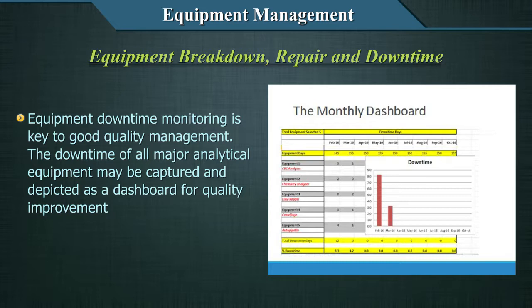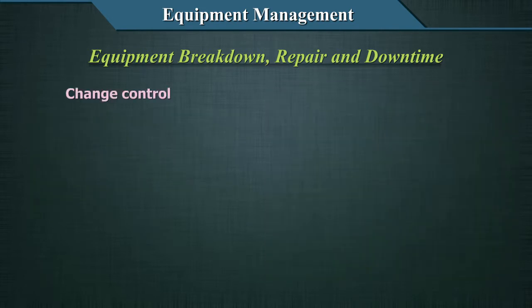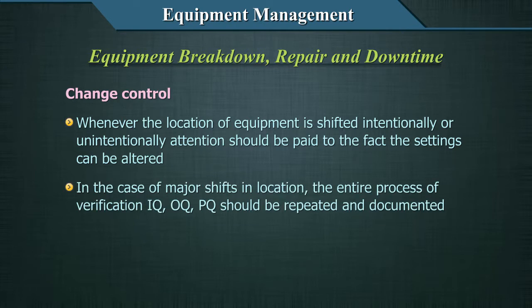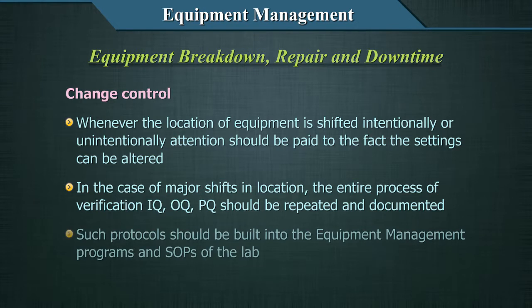Another concept in equipment management is change control. Whenever the location of equipment is shifted intentionally or unintentionally, attention should be paid to the fact that the settings can be altered. In the case of major shifts in location, the entire process of verification — IQ, OQ, and PQ — should be repeated and documented. Such protocols should be built into the equipment management programs and SOPs of the lab.